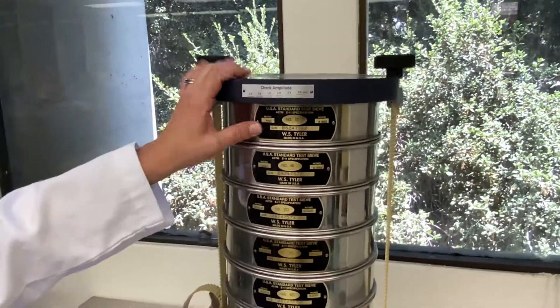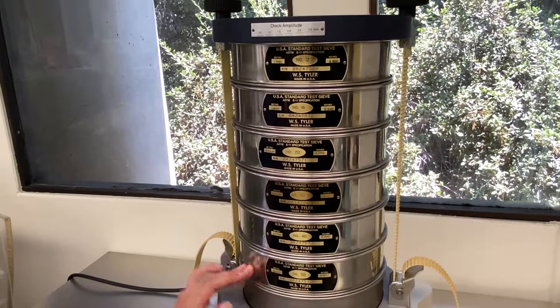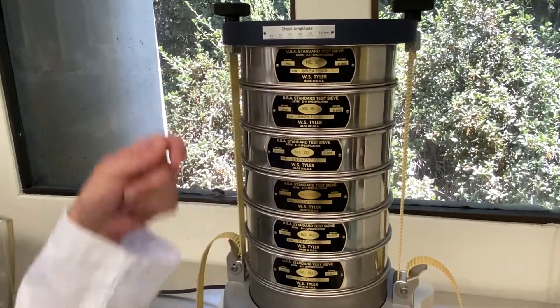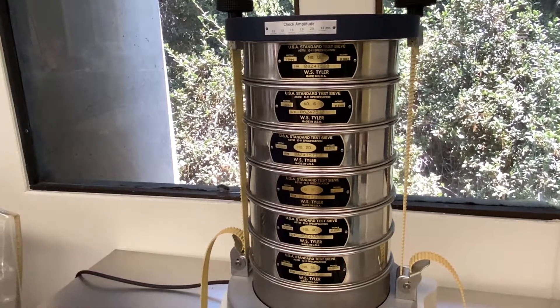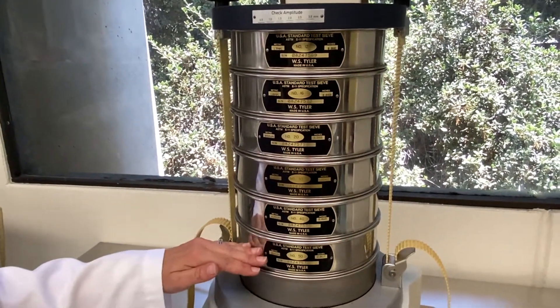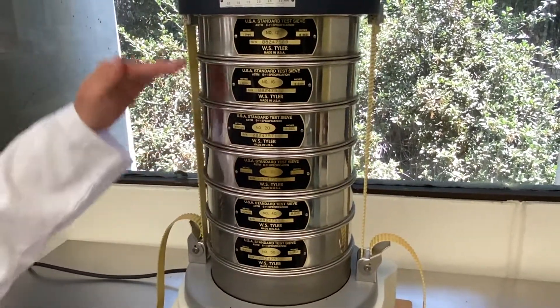We don't have any coffee in it now, but in each different layer you would have different amounts of coffee. What you do after you finish shaking is take each sieve and weigh it to see how much coffee is on each sieve. The finer, smaller particles will accumulate towards the bottom, while the larger particles remain more towards the top.